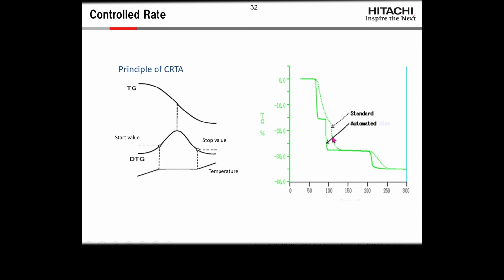Now it takes longer than the dotted curve to do the solid curve, but it doesn't take anywhere near as long as it would take if we ran the entire experiment at 1 degree a minute instead of 10.